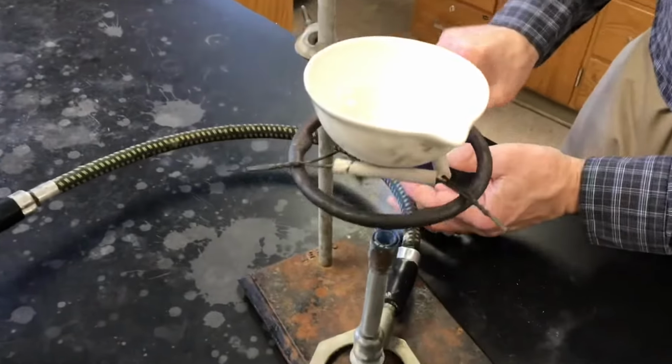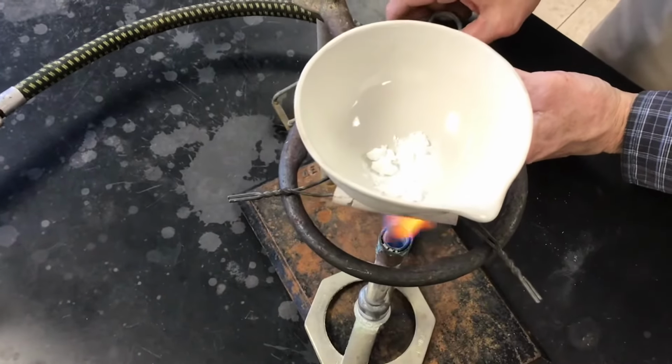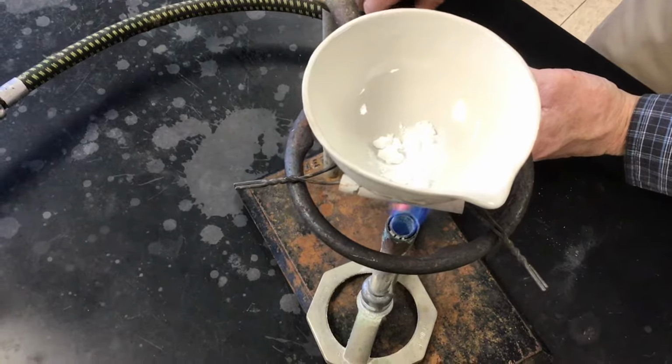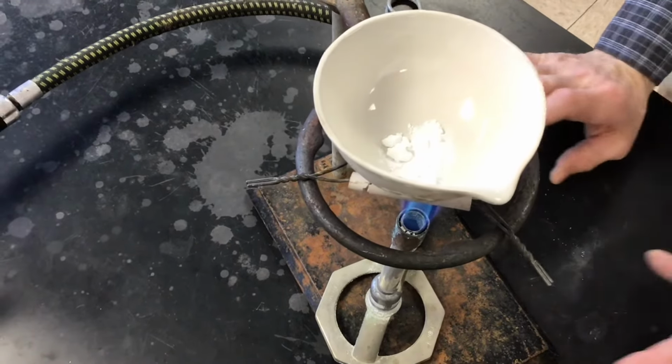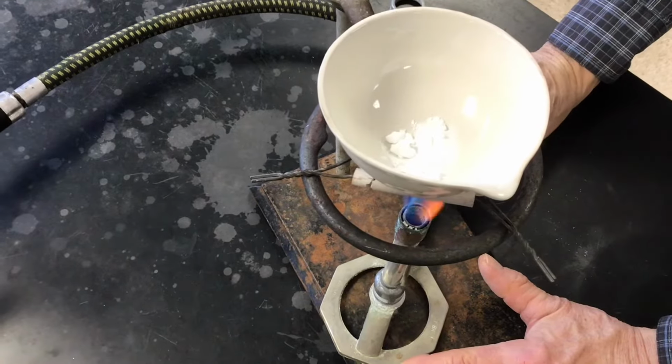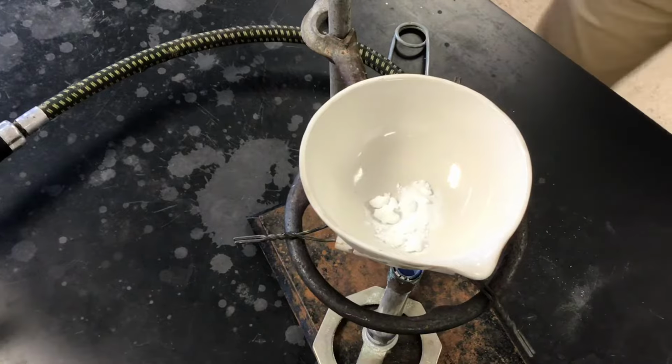This is a cool reaction too, because all ionic compounds are solid at room temperature. And this is a case where the solid is going to melt down. A lot of ionic compounds will just decompose. This one does decompose, but it will melt first. You get molten potassium chlorate.